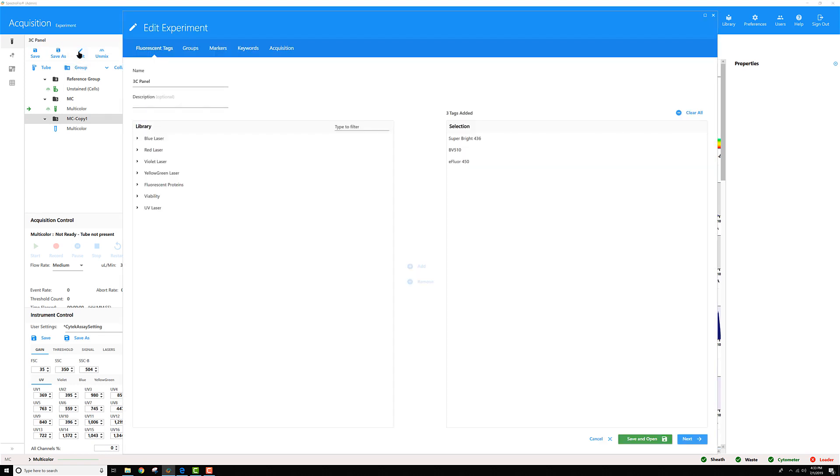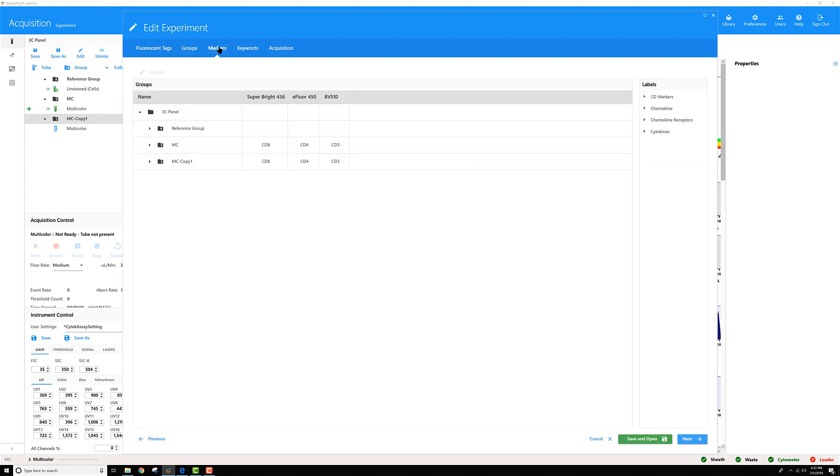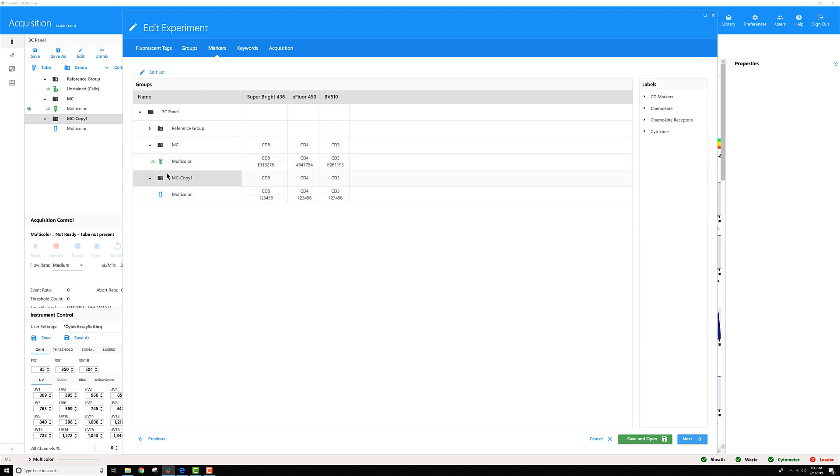If I go to Edit it and go to the Markers section, I'm going to expand my multicolor groups here.